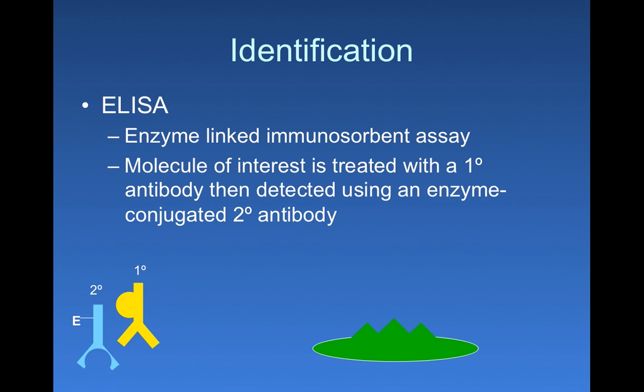Now, that Ebola protein can then be injected into the blood supply of any animal that has an immune system, and that immune system will recognize this viral protein as not normal, not part of that animal's normal protein complement. And so the immune system will react against it.